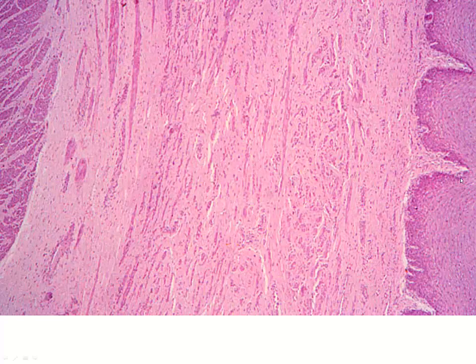And again, a closer magnification, fairly typical of what we see with stratified squamous. Basically similar to epidermal papillae, dermal papillae here. Of course, this is mucosa, this is submucosa, and then we have muscularis, the bundles of interlacing muscle present on the far left.